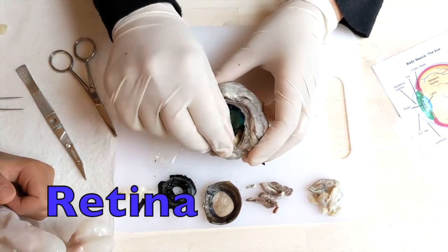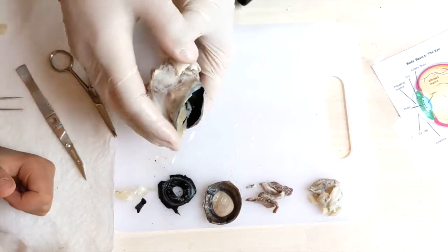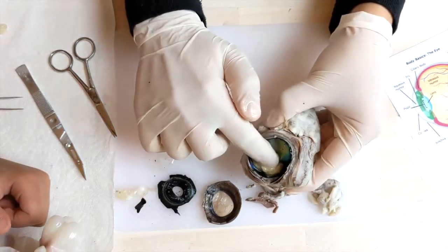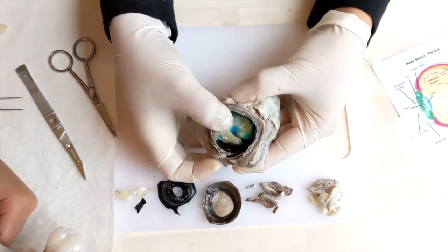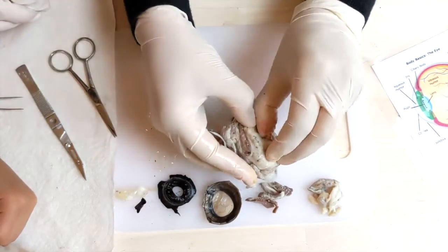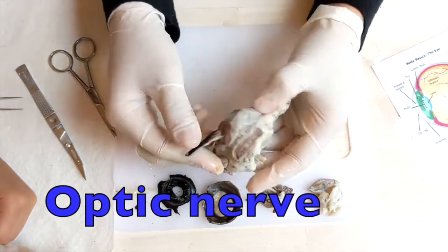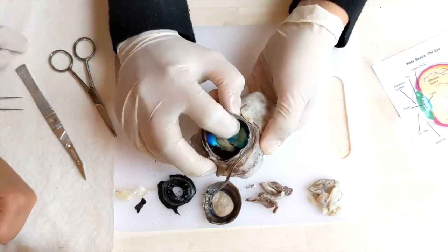So shiny. No, not the shiny part. This part right here, the retina. I want you to notice, look, it's only stuck to the eye by only like one dot, one thing right here. And if you look in the back, this thing that goes to the brain is called the optic nerve. Exactly, this is the optic nerve, and the retina is connected to the optic nerve. Oh, so that's what's holding it? Yes, that's what's holding it.